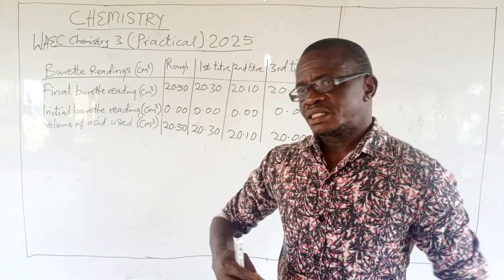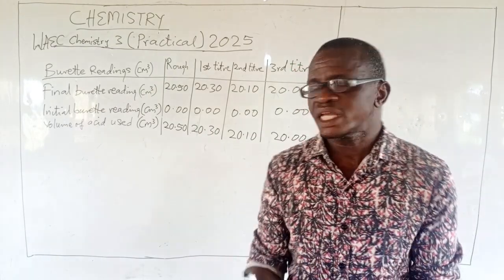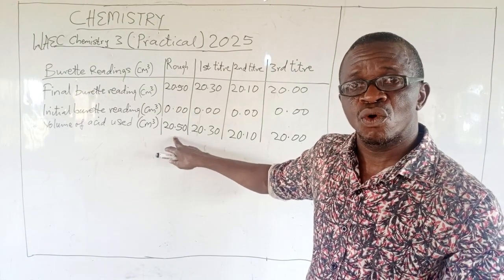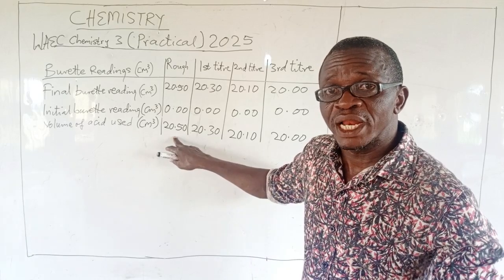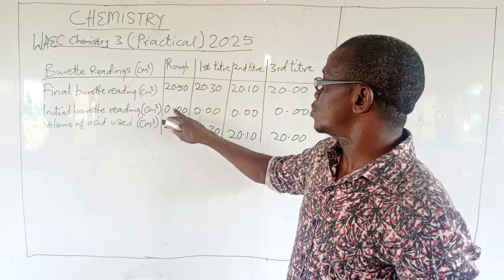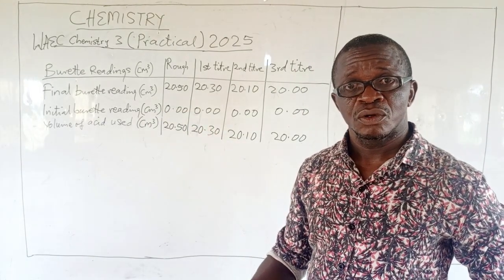if acid is given, there's that common belief that as you are running in the acid into base, titrating, at a point you get to the end point. Because you don't have a pre-knowledge of where the titer value is, you might overshoot the titration.